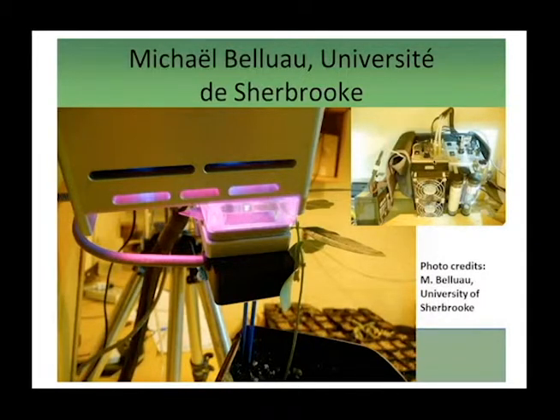So he's using the front accessory module for temperature with the big fans on it, and the one in the back corner for the light. We are very interested to see the results of Michael's study on drought tolerance of forbs in the coming months as he works on it this summer.